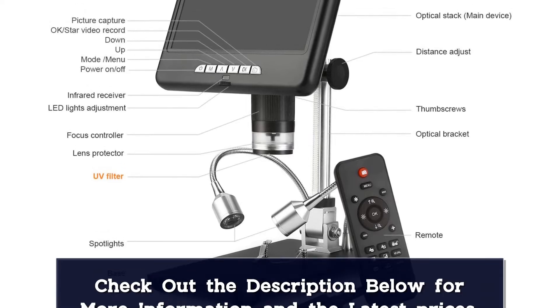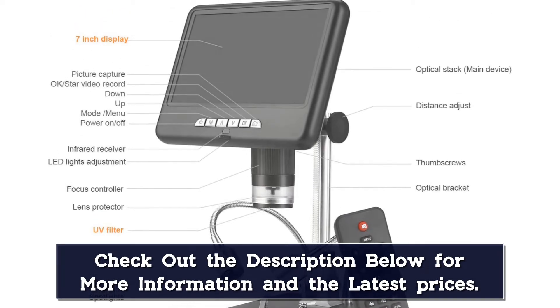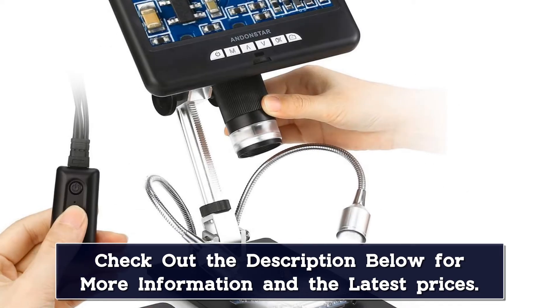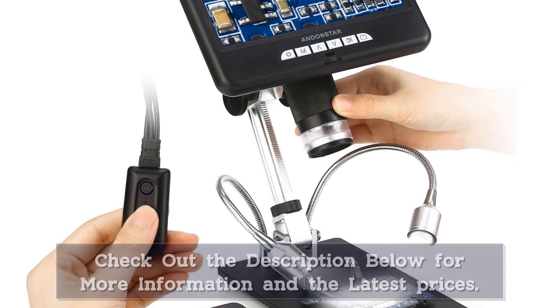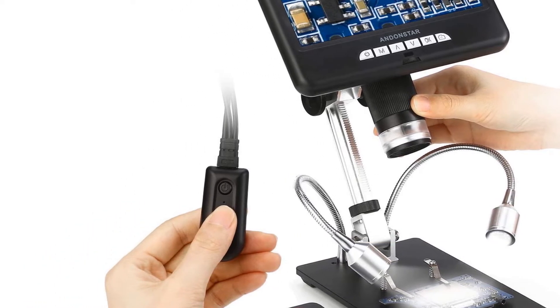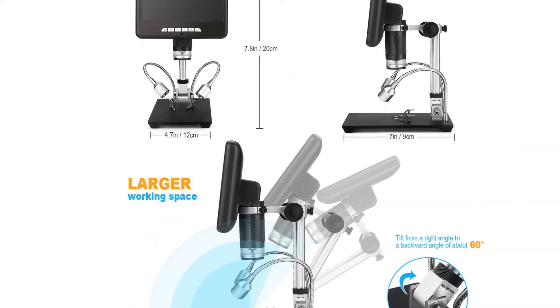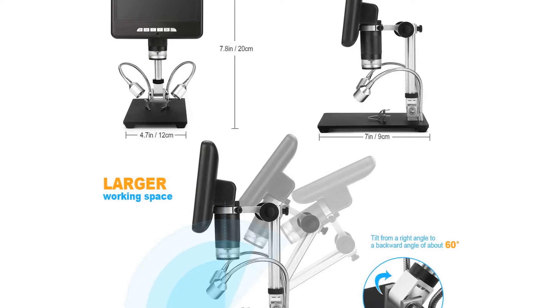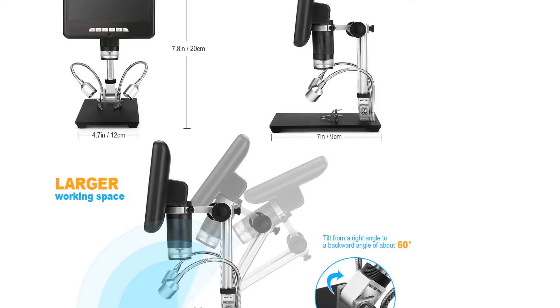The high-quality adjustable stand lets you adjust the magnification and distance between the camera and the object via the controller, which minimizes shaking and keeps your specimen in sharp focus. Eight LED illumination with adjustable intensity control allows you to set the desired level of illumination and includes a measuring scale. Two full lights on both sides can be adjusted freely, with brightness controlled by the dimmer switch, offering a bright and clear image and video.